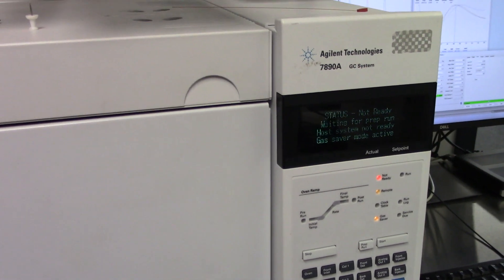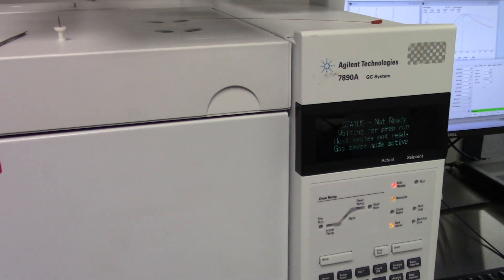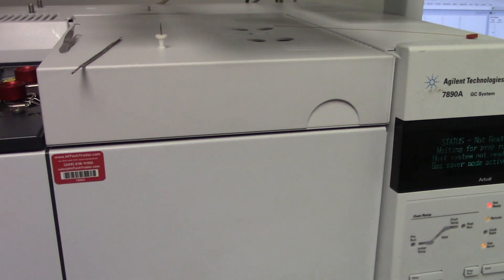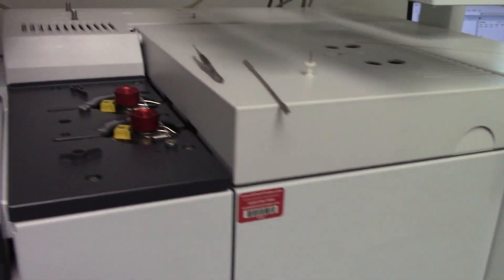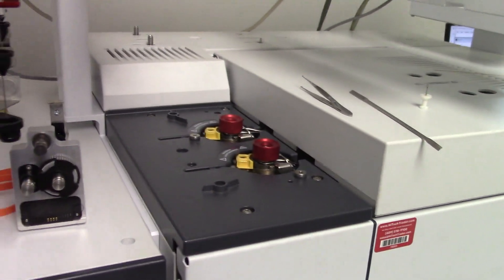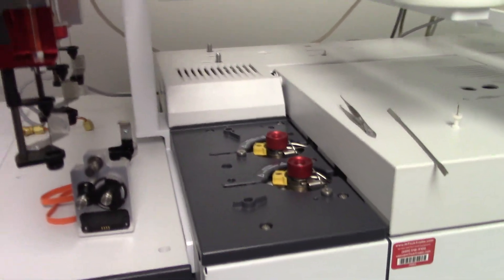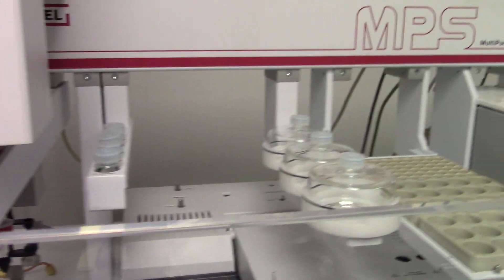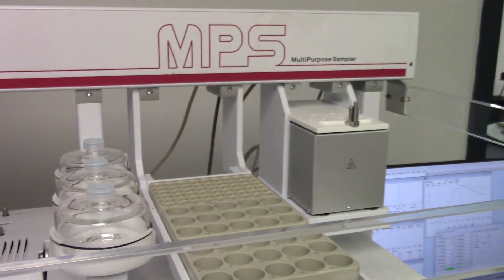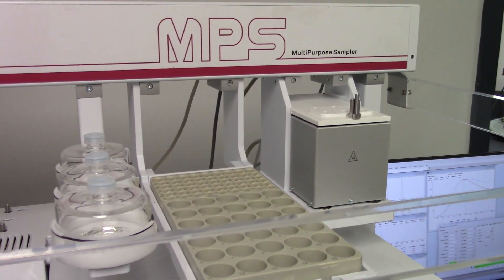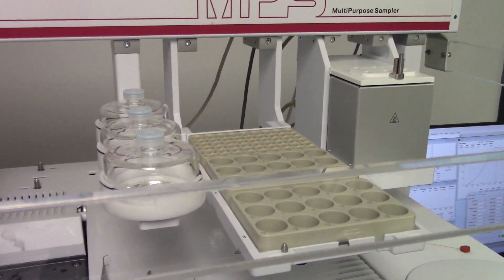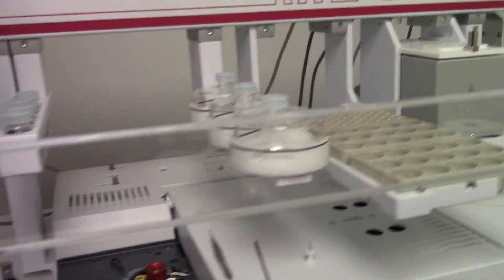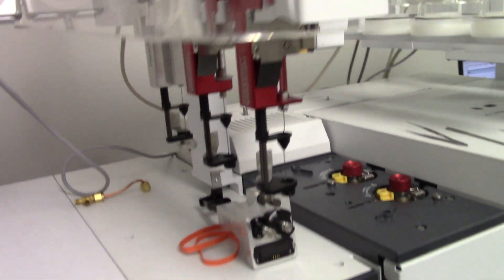This particular GC system has a TC and FID. It also comes with a Gerstel Headspace Auto Sampler. It's a very dynamic system.